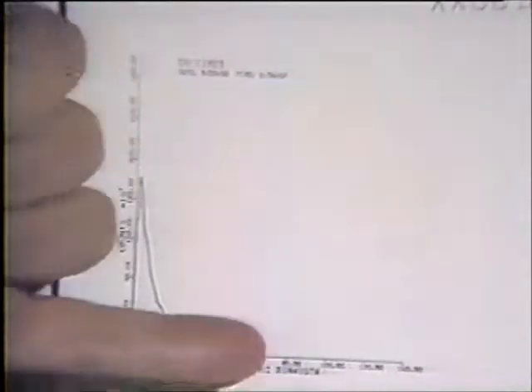This is the on times. This is a linear plot of the number of counts versus time. And these are 100 microsecond bins. There's a roughly exponential decay. The number of components in this decay is an indication of the number of open states. Similarly for closed states. If there are two components, there are two closed states, provided that there is actually only a single channel present. If there's more than one channel present, the conclusions are not nearly so simple.